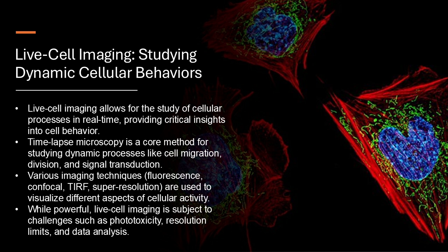Another challenge is dealing with the sheer volume of data. Oh, the data deluge. That's a problem in so many areas of science these days, especially with all this new technology. Exactly. And live cell imaging experiments can generate terabytes of data. Wow, terabytes. And analyzing all that information can be incredibly time-consuming and complex. We need sophisticated computational tools and algorithms to help us make sense of it all. So it's not just about capturing the images, it's about processing and interpreting them. Exactly. The data analysis is a critical part of the process.